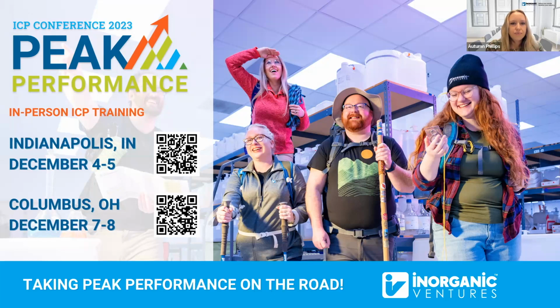If you're trying to do trace analysis, definitely check it out. So the next question is, will the sodium bullet test work as well as the yttrium bullet test? Very good question, and I meant to mention it: absolutely. Any bullet, anything that you can run that makes the area that I showed visible, yes. Sodium is one of those that doesn't require you to get yttrium or anything else.